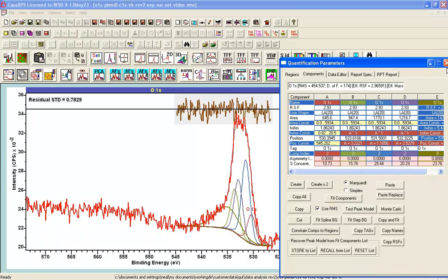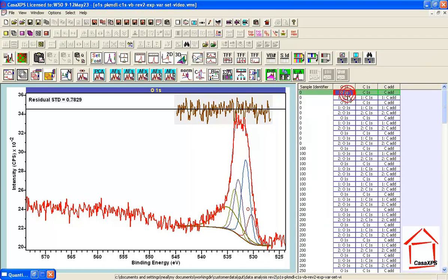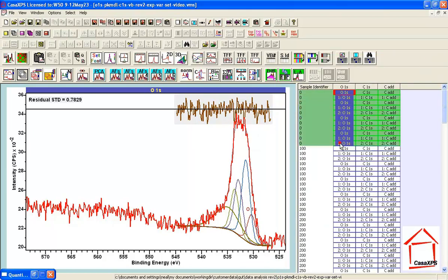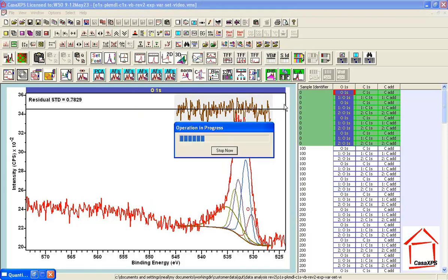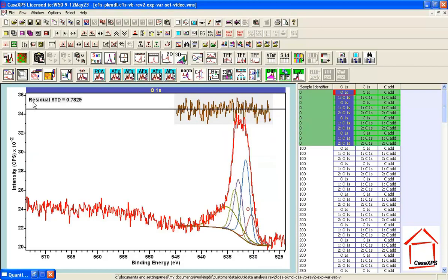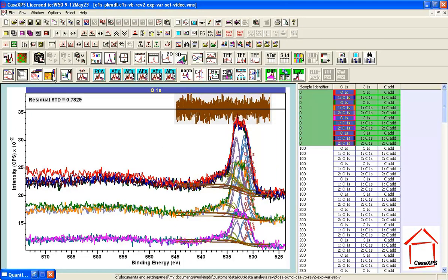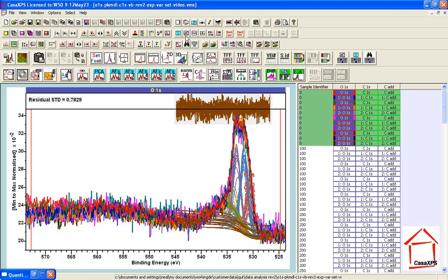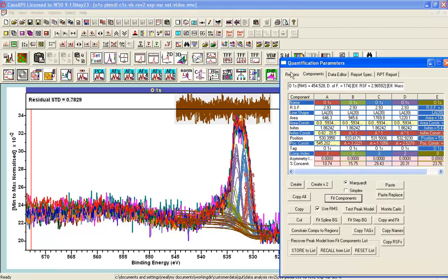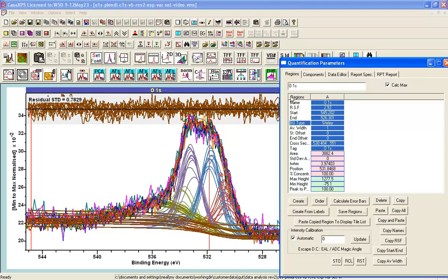Verifying we have a good fit once we apply this constrained peak model — and we do. Now I'd like to propagate the peak model constrained to the average spectrum to all the other spectra by right-clicking: propagate regions, components, auto-fit. Overlaying with double normalization, we can zoom into the region, and it's not surprising that we get a much more consistent answer for these data.